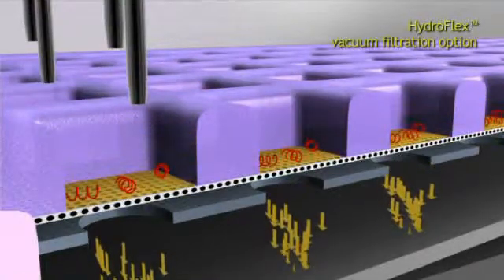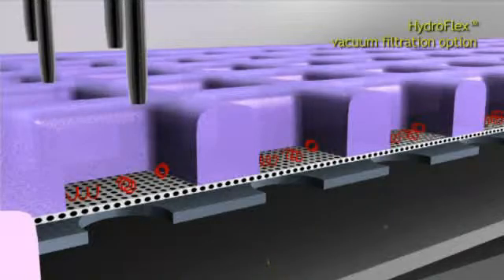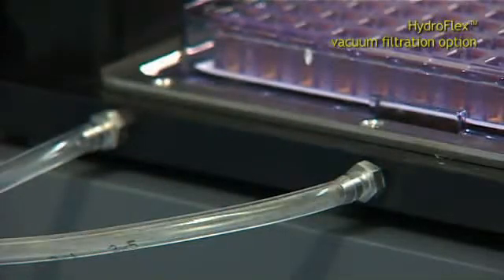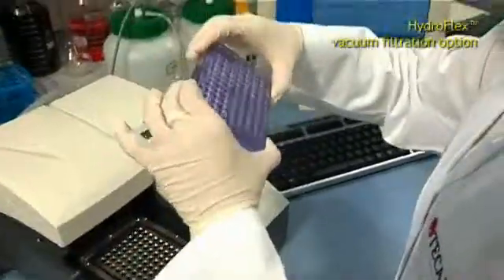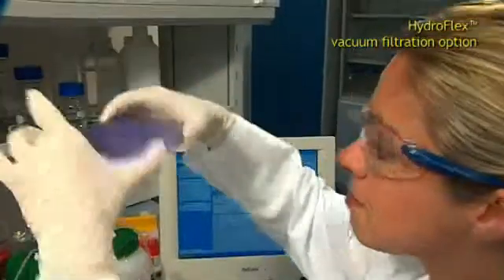Filtration, dispense, and wash steps can be combined and repeated as needed. Specially developed drop trays help to keep the filtrated plate dry and make manual preparation a thing of the past.